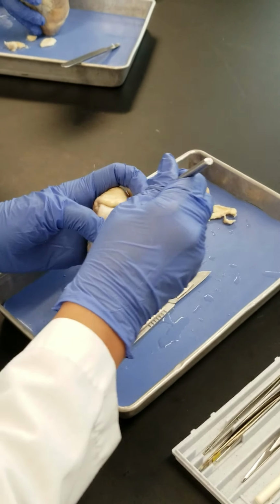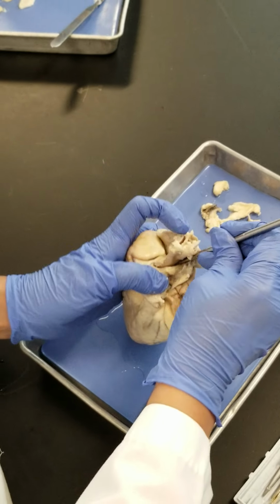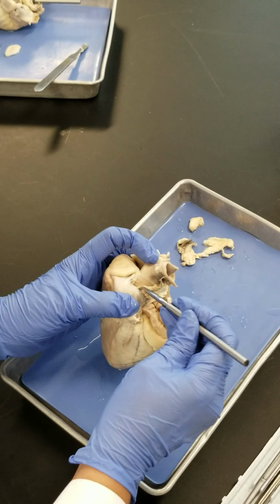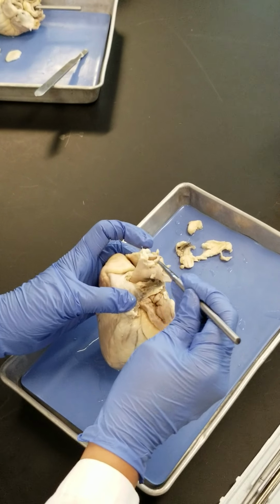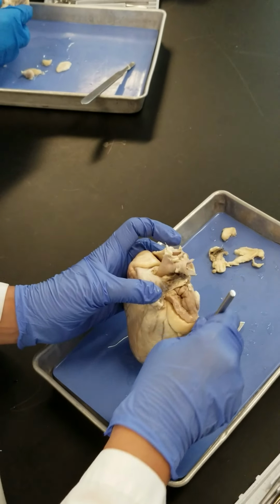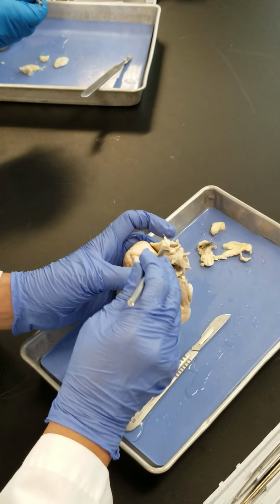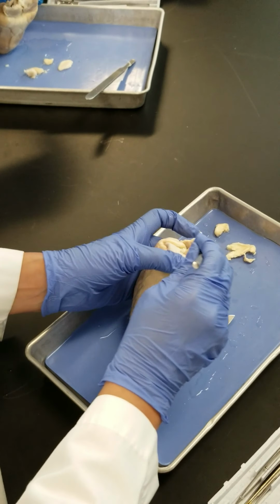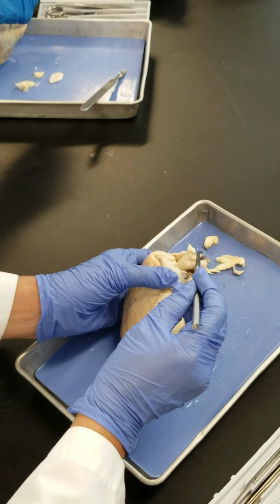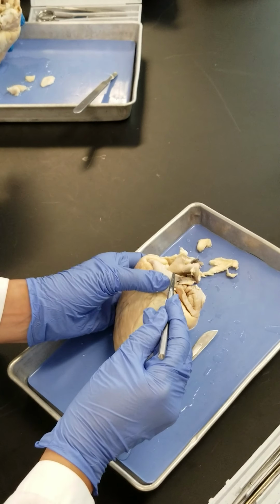Now for the aorta, first we have the ascending part that is deep over there. If we continue and dig more, you would be able to see that, but we don't want to cut them all completely separate. So after the ascending part, you have the arch of the aorta, and then if it was continuing, you could see the descending aorta. But it has been cut here, right? This is the arch of the aorta, as you see here, and it has been cut here. So you have only one branch from the arch of the aorta that you see here.